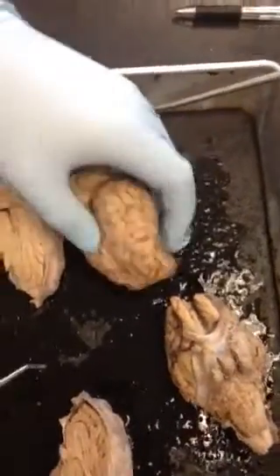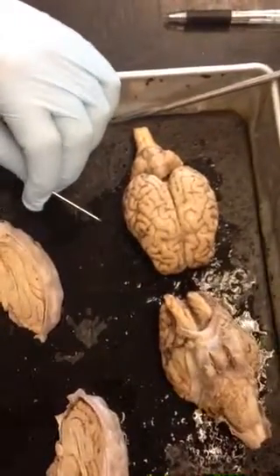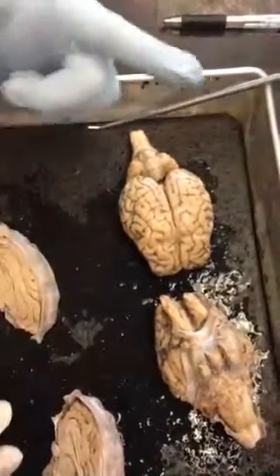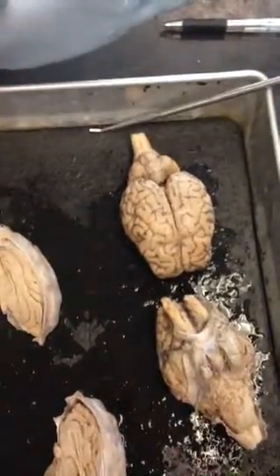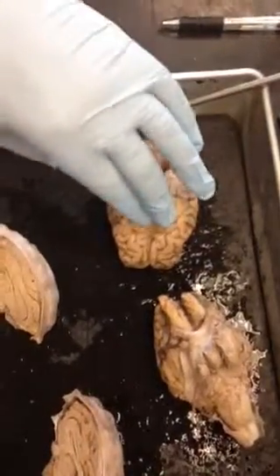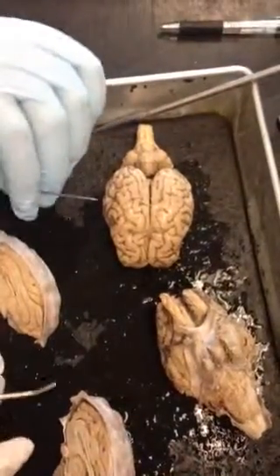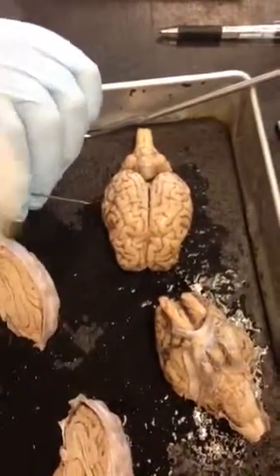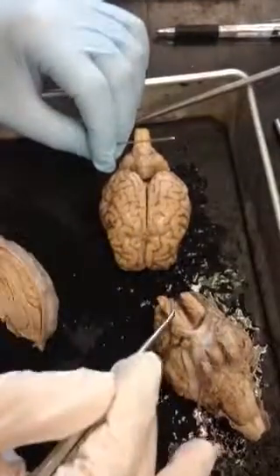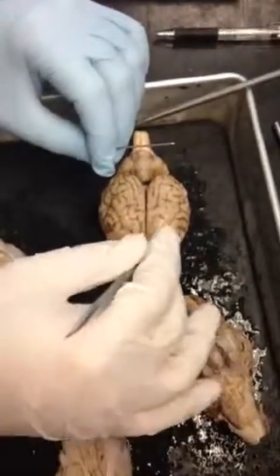All right. So what does the central sulcus do? What's the function? Because remember, you need to know the function of all these too. It separates the parietal from the frontal, right? And then what else? So what's the functional part of up here and right here? Yeah, so there's the post-central gyrus and pre-central gyrus.